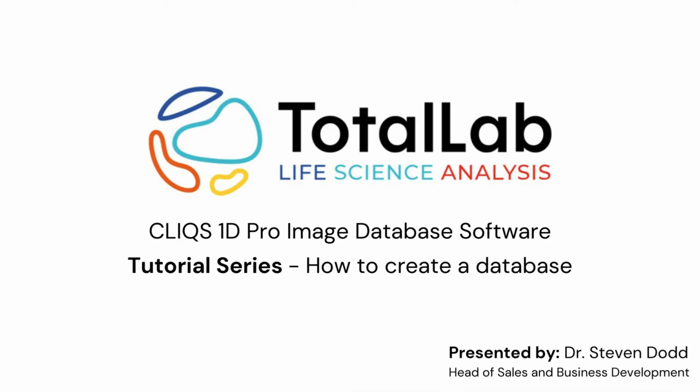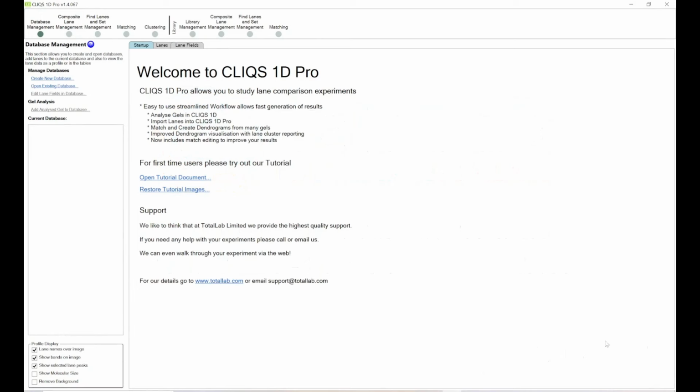within those different gels. When you first open our CLIQS 1D Pro software, you're greeted with this screen, where the software invites you to start creating your database using the lane and band information that you've identified in your images from our CLIQS 1D software.